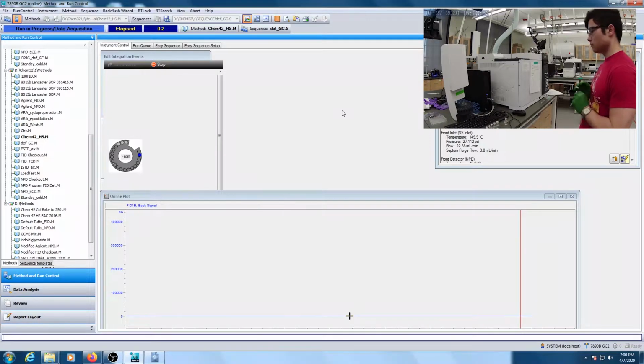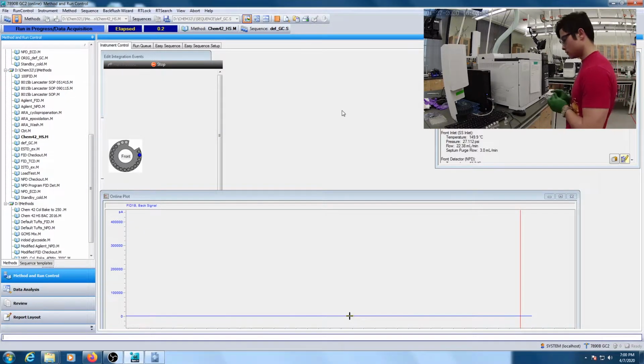And this is the most fun part of chromatography, waiting for the separation to happen and looking at the chromatogram as it develops. By the way, the solution I just injected was reference sample R1, which is a 10-fold dilution of the propanol internal standard. So what this run is going to reveal to us is where propanol elutes on this column.